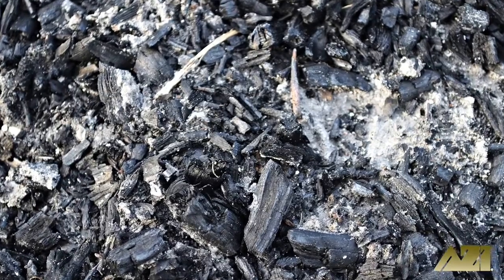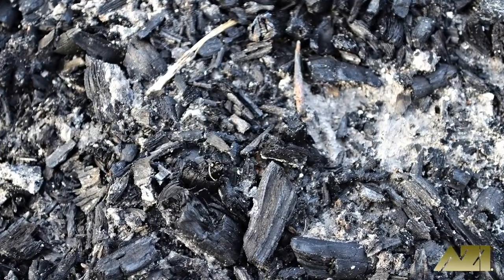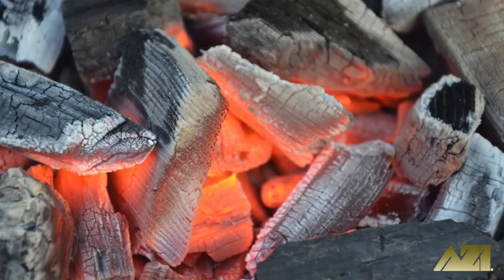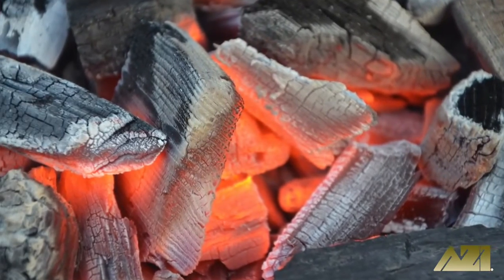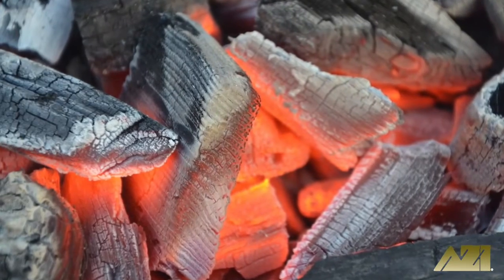Since higher ash content means that there is more material present that's not combustible, heat intensity of higher ash materials tends to be lower than materials with a lower ash content.